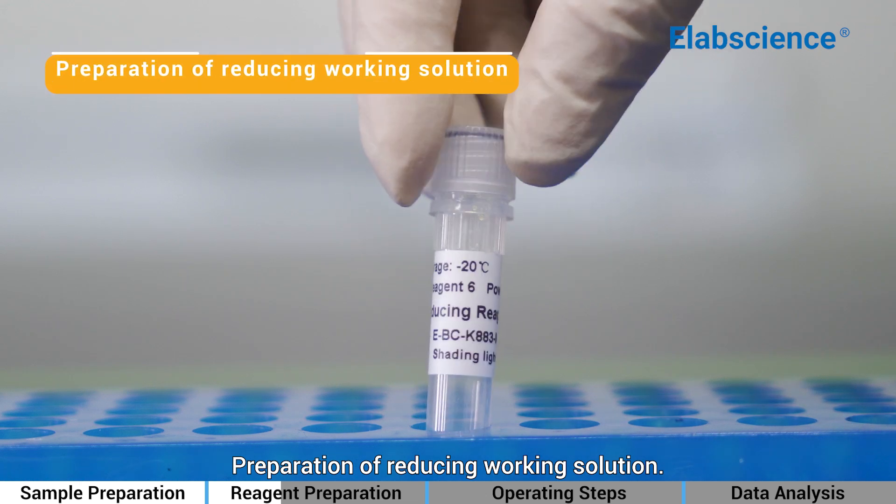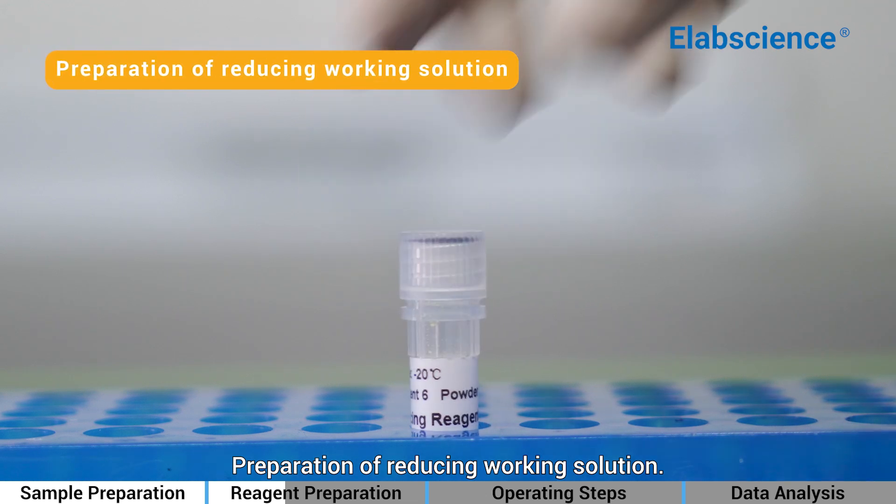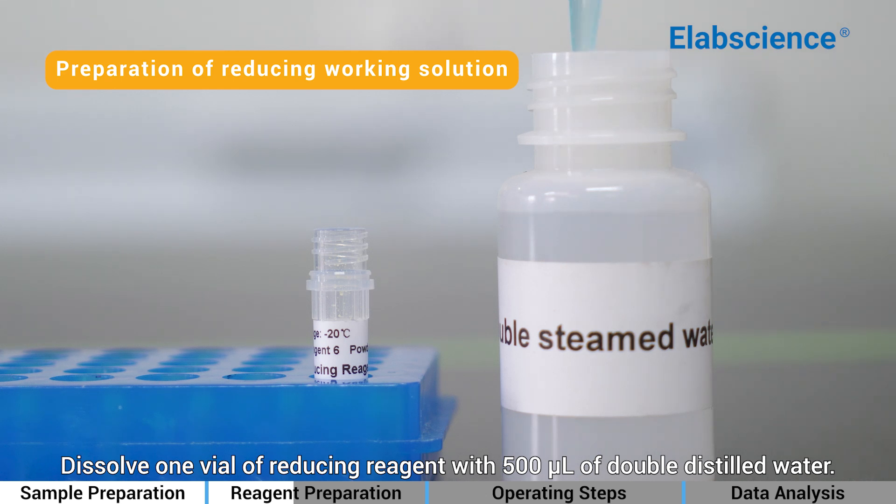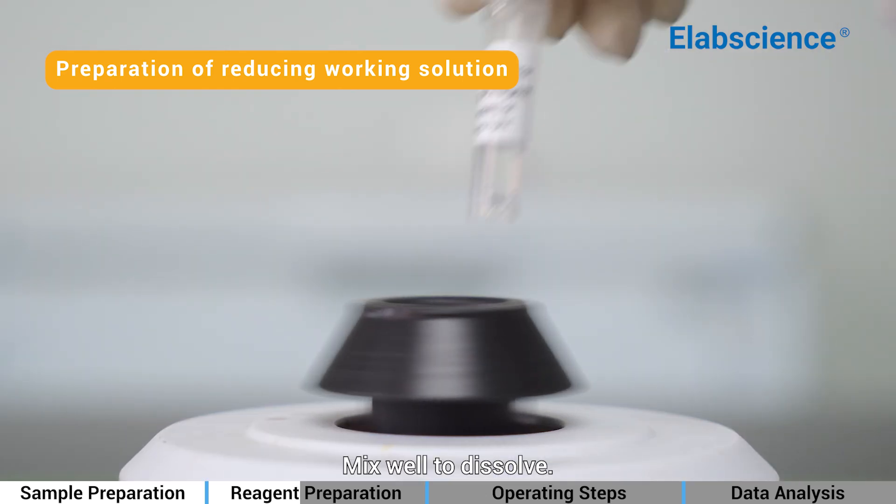Preparation of Reducing Working Solution: Dissolve 1 vial of reducing reagent with 500 µL of double-distilled water. Mix well to dissolve.